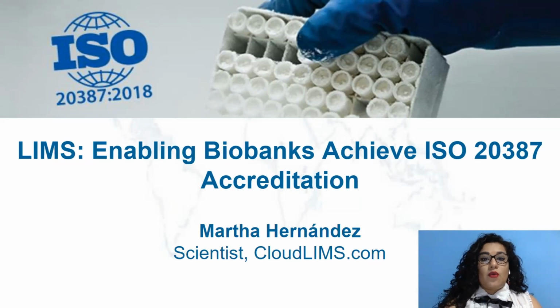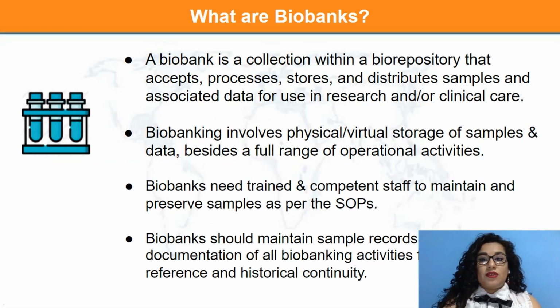First, let's define what a biobank is. Well, a biobank is a laboratory facility that accepts, processes, stores, and distributes samples and data for use by research institutions. Biobanks manage biological samples such as blood, tissue, saliva, plasma, cells, and the related information, and they can be used by third-party research institutions for research purposes.